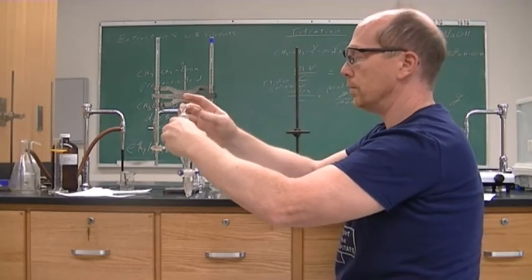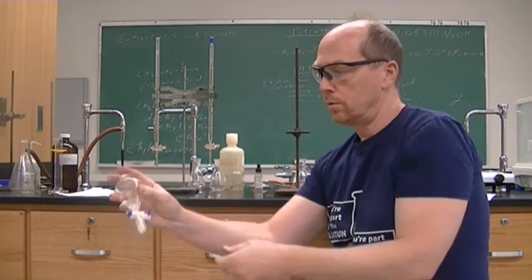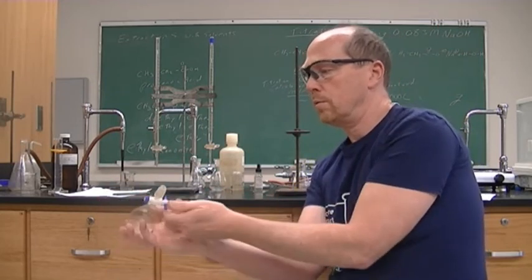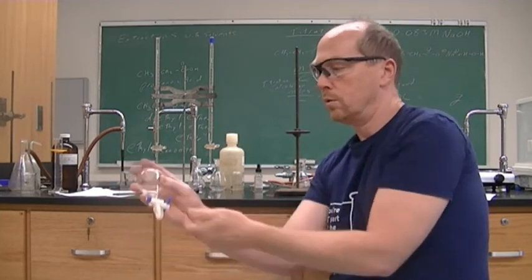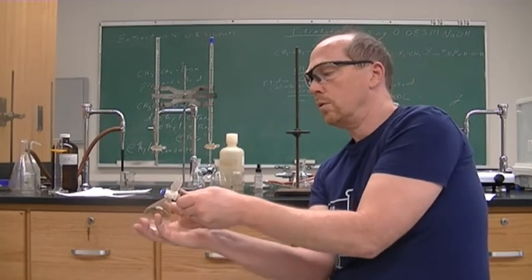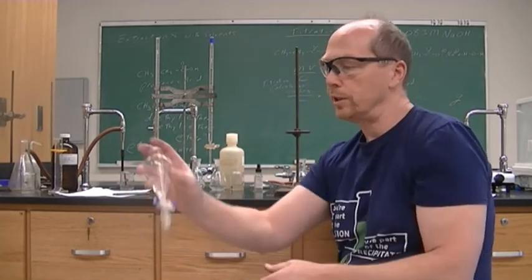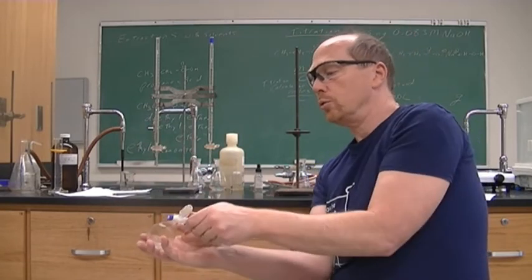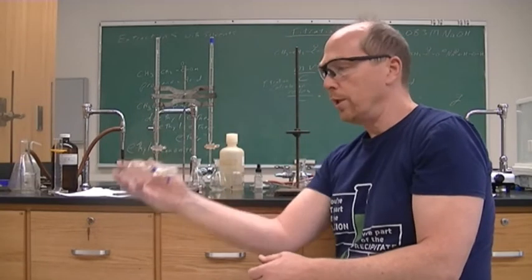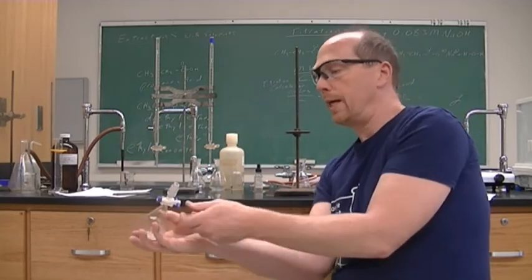Put the lid on, vent, vent. So the less noise, it's reaching its equilibrium, and then you're able to mix it so that the ether is interacting with the aqueous layer, extracting the propanoic acid.